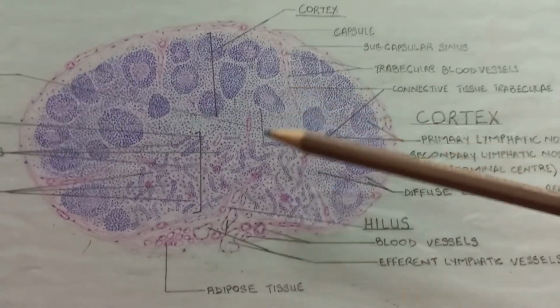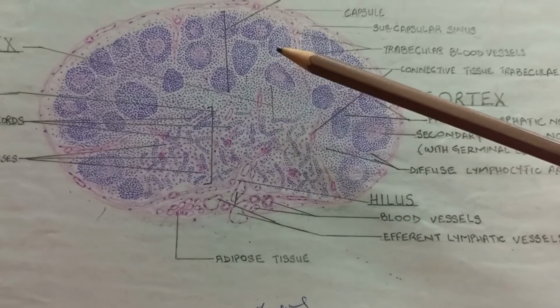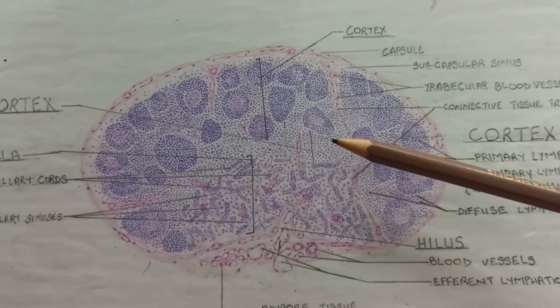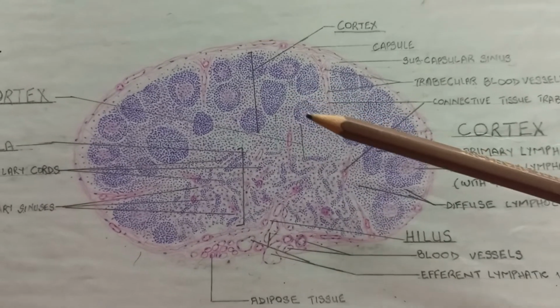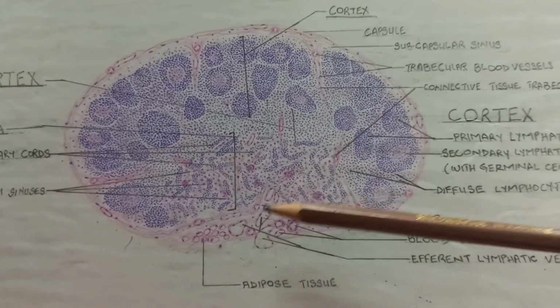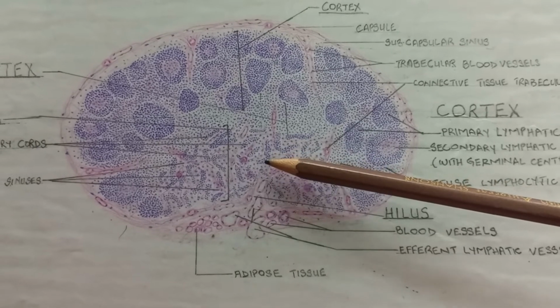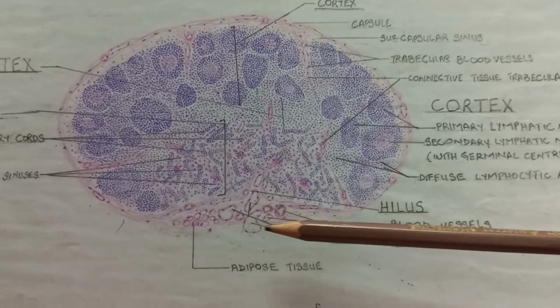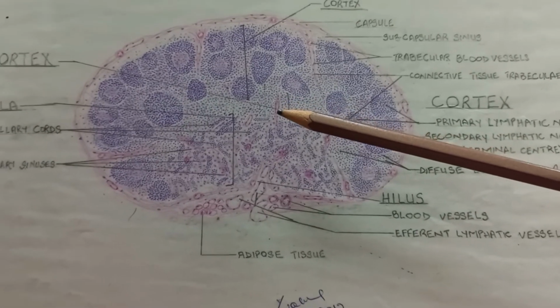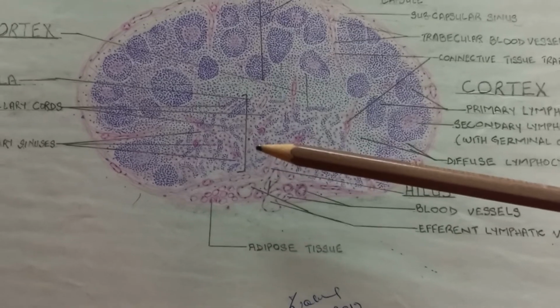Then after the cortex comes the medulla. In the medulla, you will see the trabeculae, the connective tissue trabeculae which were coming from the capsule and dividing the cortex into irregular compartments. Now these trabeculae will become branched and fuse with the connective tissue of the hilum. And now I will point out two things in the medulla: medullary cords and the medullary sinuses.